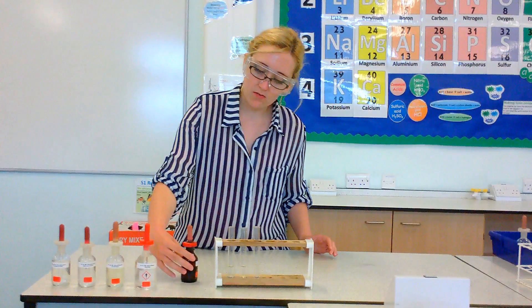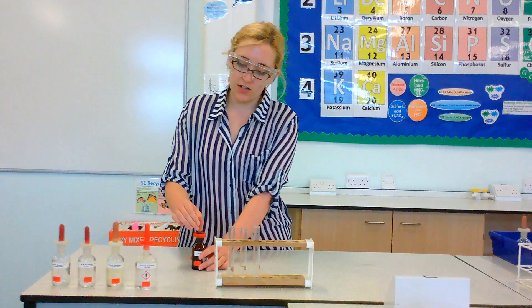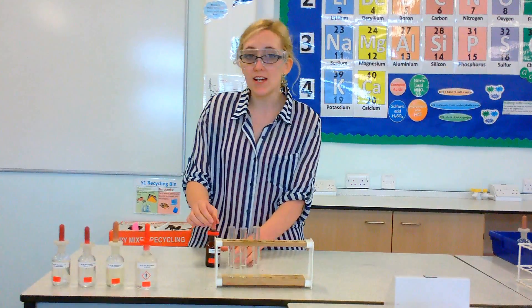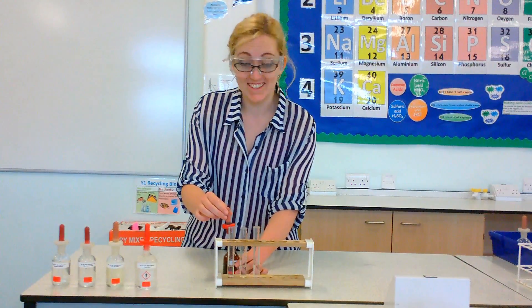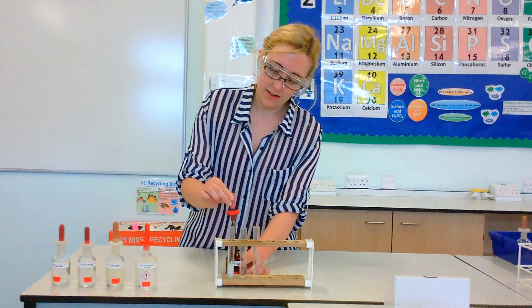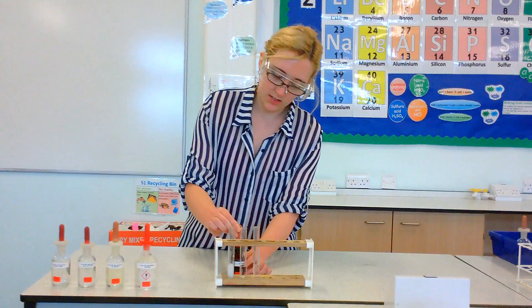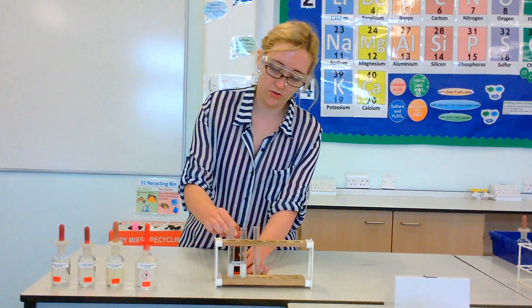Then we're going to add about a centimetre's depth of silver nitrate. Now silver nitrate is fairly expensive, so you have to be very careful not to spill any, very careful not to do the test wrong, and not to do this too many times, because it contains silver. So it's about a centimetre. And you can see as soon as I pop that in, something starts to happen to the solutions.